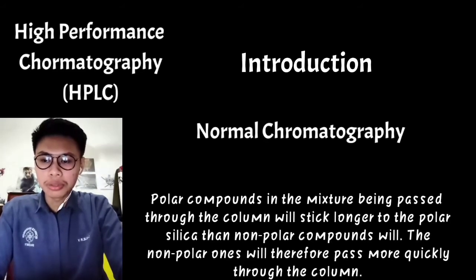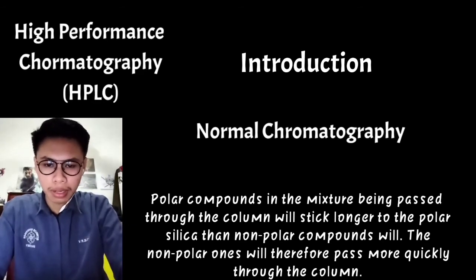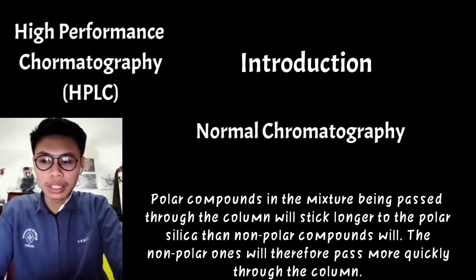Polar compounds in the mixture being passed through the column will stick longer to the polar silica than nonpolar compounds will. The nonpolar ones will therefore pass more quickly through the column.